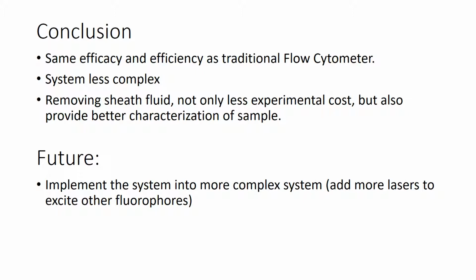In the future, as I mentioned, a correlation of the area shown on the diagram has to be done, in my opinion, to relate this area to more precise results such as the shape of the cells or particles or their numbers.